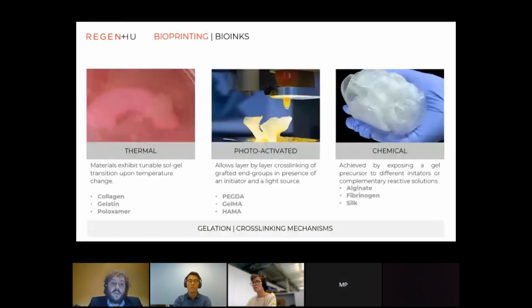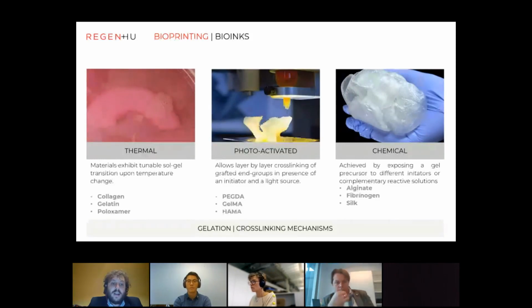One of the key factors to consider when preparing a bioprinting process is the choice of the right biomaterial or bioink. Bioprinting has some unique features, but it also comes with some very specific characteristics, like the need for the cells to survive the dispensing process. For this reason, for example, it's not possible to apply high pressure levels, to avoid excess shear stress to the cells. That's why the most commonly used materials in bioprinting are ones with a relatively low viscosity, but with a quick gelation or cross-linking mechanism after deposition.